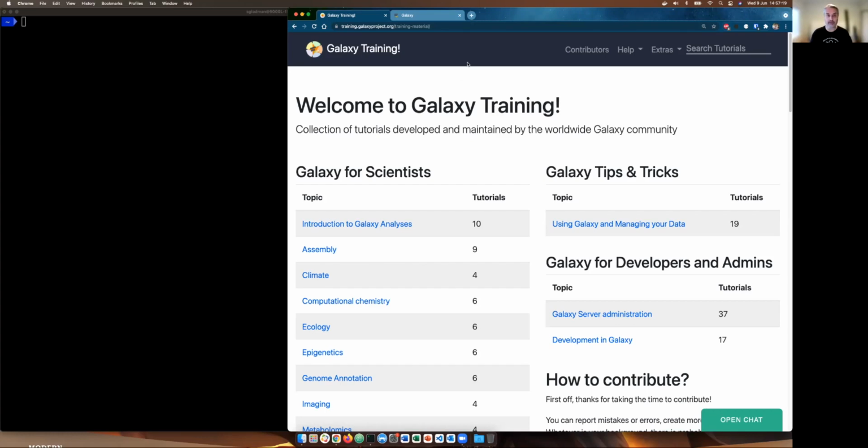So hopefully everybody has already completed the installing Galaxy with Ansible tutorial. If you haven't, then you'll need to go and do that first, because we are going to be extending that tutorial here to include the Singularity components.